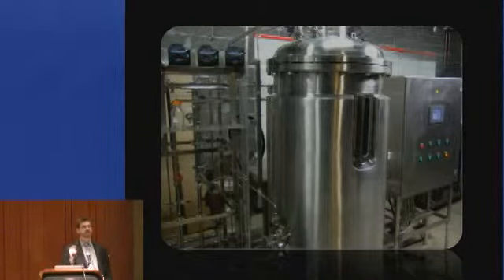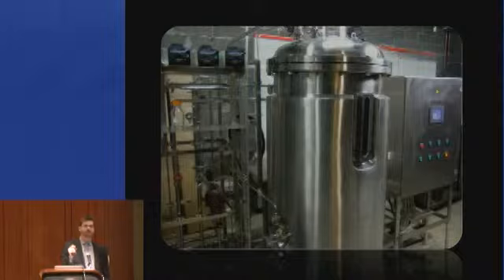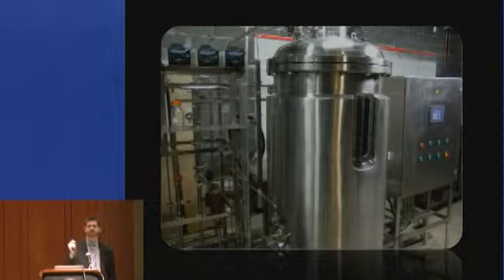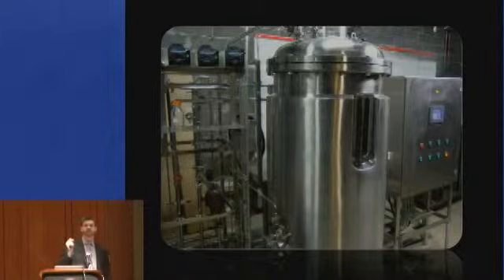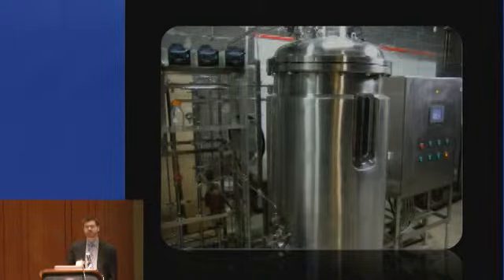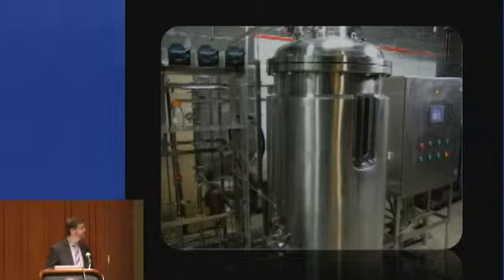Now, in mass production of this sort, typically there's a thought, and that is that I started with a clonal cell line to produce this drug. I picked somebody that should be, in principle, genetically identical, and I'm going to use that as a source material to produce everything else. And because it's genetically identical, I'm going to abstract that these cells all behave the same and contribute to product equally. So what I want to tell you today is a story about how we've started to uncover that this is not true, using single-cell tools to understand the production of these protein drugs in Pichia.